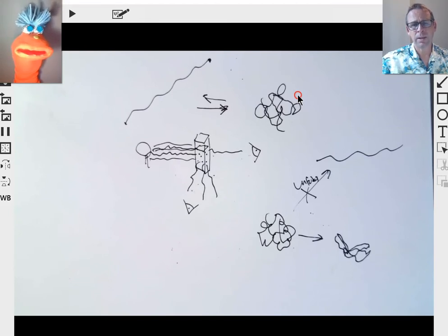And that results in a solution, 50% DMSO, 50% water, that you can begin to dissolve lots of hydrophobic molecules, hydrophobic compounds in, and therefore they're available to perform chemistry on. If you just put some powder that won't dissolve in the water and the powder goes down to the bottom, it's not going to be able to react. You're not going to get any reaction.